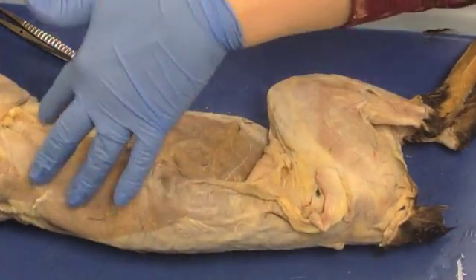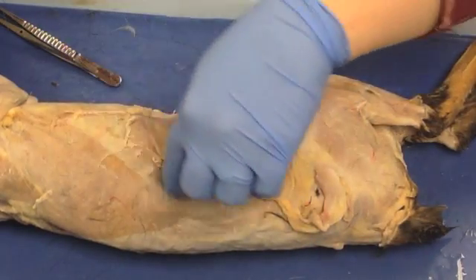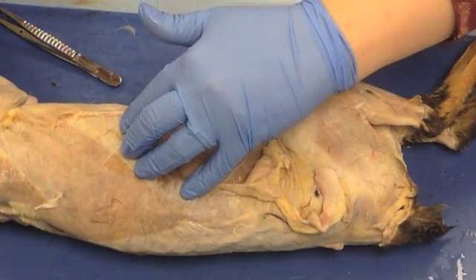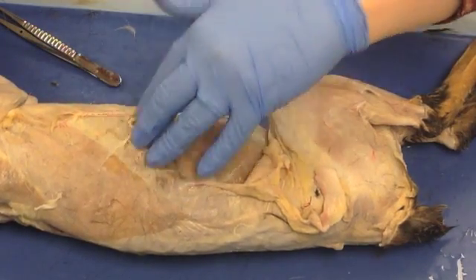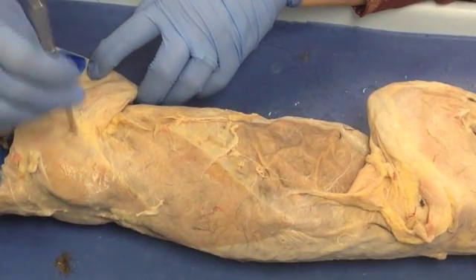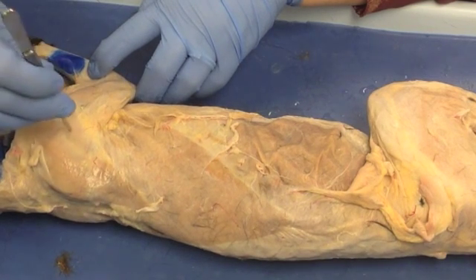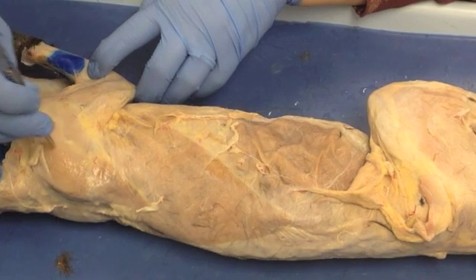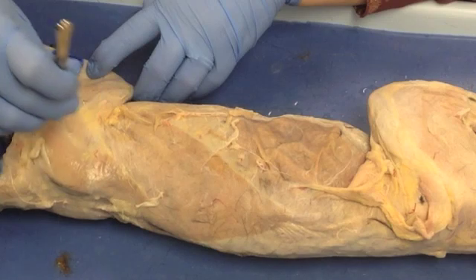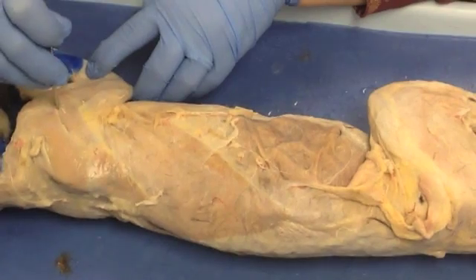The same is true for latissimus dorsi — you've got a free edge that's simply bound down by some connective tissue, so it's better to start at the top and work your way down. Here we have one of the deltoid muscles, and in that case it's better to start at the middle, lift away some of the connective tissue, then find the edge and remove the material from the edges.